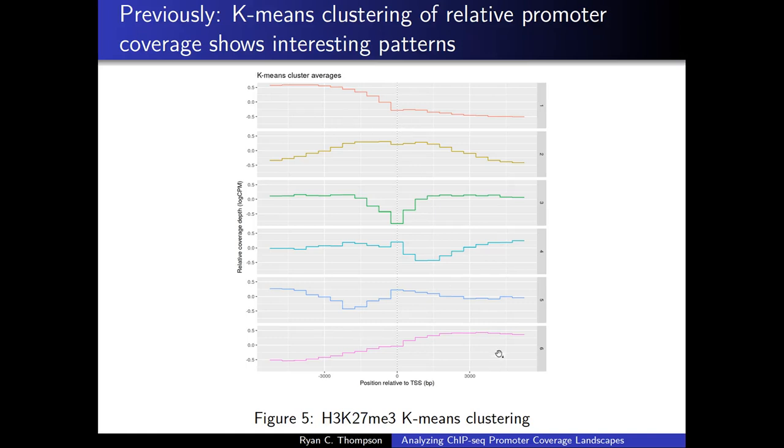And we got some interesting clusters. I should mention this is only looking at the naive day 0 data averaged across all 4 donors. So a very preliminary, simplified way of looking at just a subset of the data, just to see if there are some interesting patterns there.